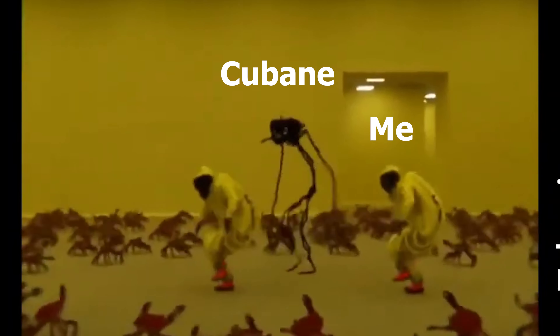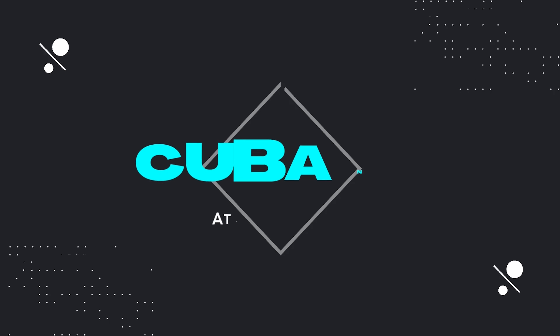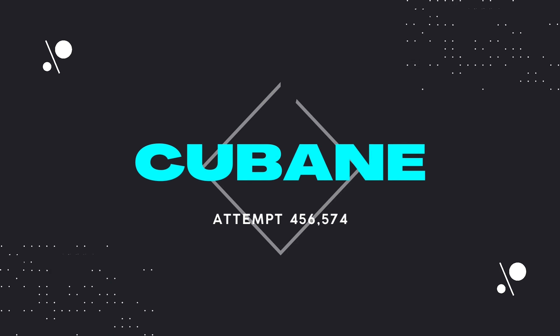We finally got good yields. It's been quite a while since we've had an actual Cubane video, and here one is. I've been chasing this for quite a while in the background. This is the Diels-Alder product, and it's probably the hardest step. I'm not even worried about the cycloaddition or anything. I just had failure after failure after failure. I think this is the eighth attempt, and I finally got some good yields, and I'm excited to show you that process. But there's definitely been a lot of struggle.